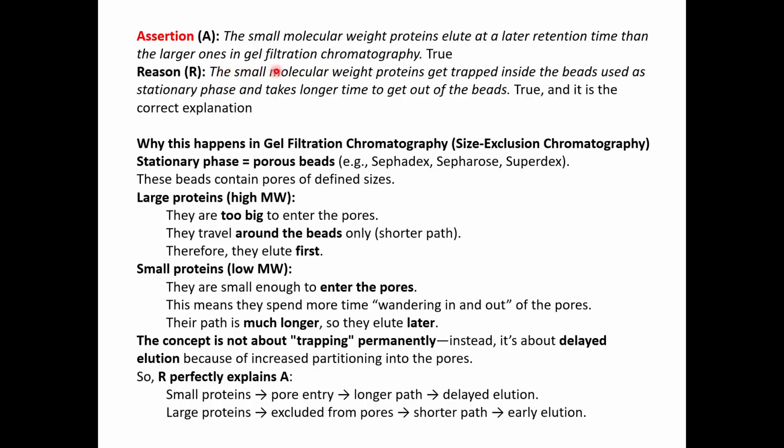The reason they have given is that the smaller molecular weight proteins get trapped inside the beads used as stationary phase and take longer time to get out of the beads. That is what we discussed. So this is also true and it is the correct explanation.